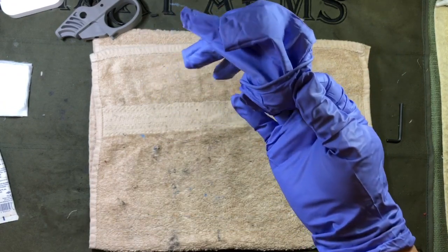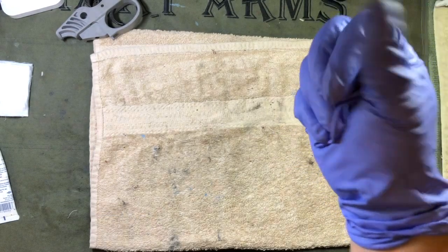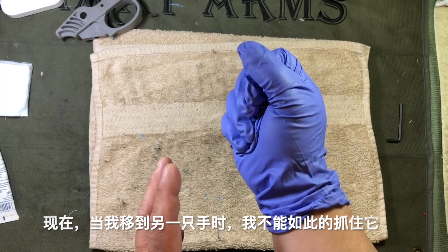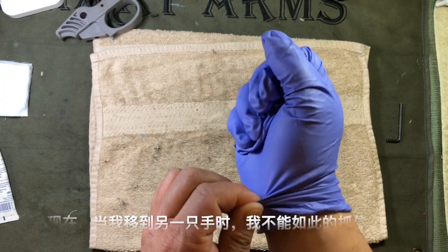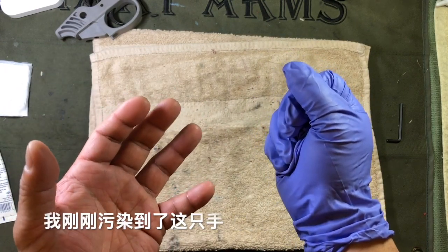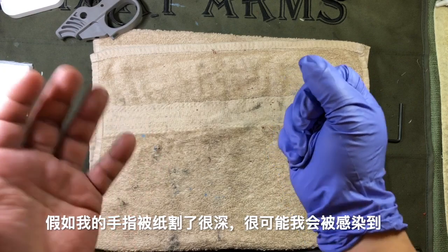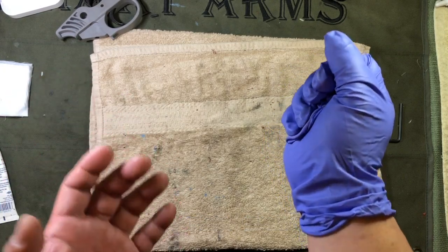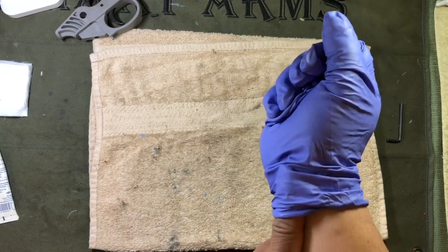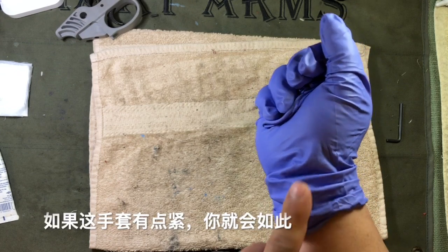I'm going to maintain control of this glove in the gloved hand. The dirty glove that just came off — I'm going to crumple that and trap all of it inside a fist. Now when I move to the other hand, I don't want to grab the outside of the glove like this. Imagine blood, pee, and poop all over it — I've just contaminated this hand, and if I have a deep paper cut, I've possibly infected myself. So what I'd like to do is get one finger inside the cuff.